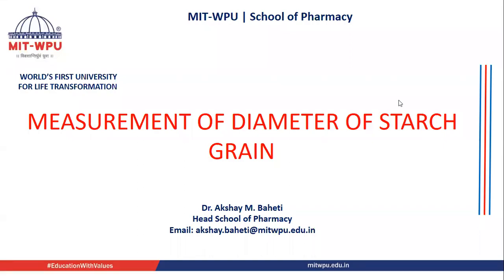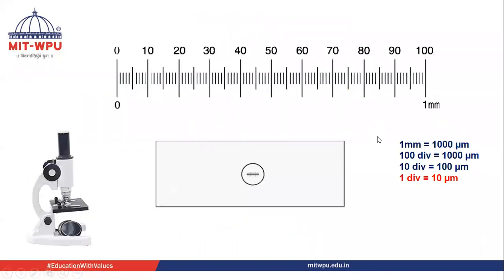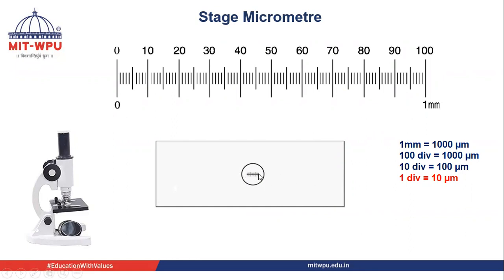The aim of today's practical is measurement of diameter of starch grain. For this, we need a stage micrometer. It's a glass slide where we can see a circle and a scale is placed in between.